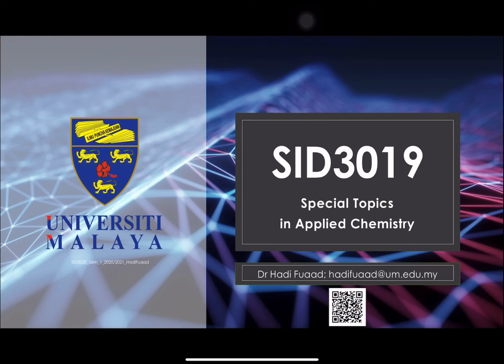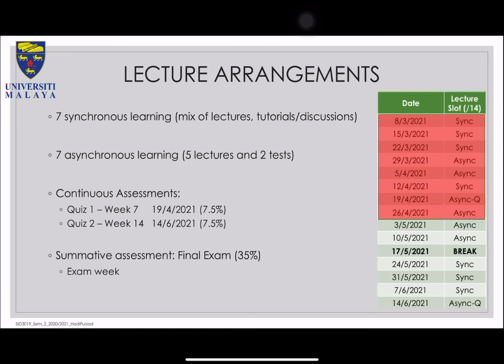Welcome back to SID3019. So today we're going to look at the third option for peptides and protein analysis, which is NMR spectroscopy. So as of today, we are over here.